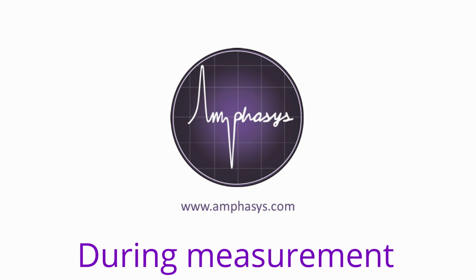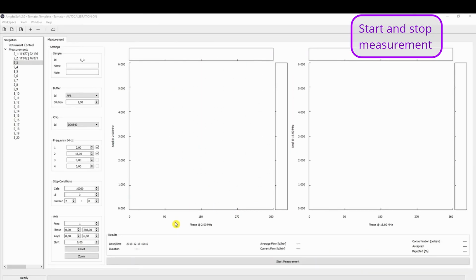Second phase, during measurement. Now it is time to start the measurement of the sample. To start a measurement, click the button Start Measurement at the lower end of the measurement window. Please note that by standard, the first phase that will follow is a loading phase as indicated by the status window on the lower left side.